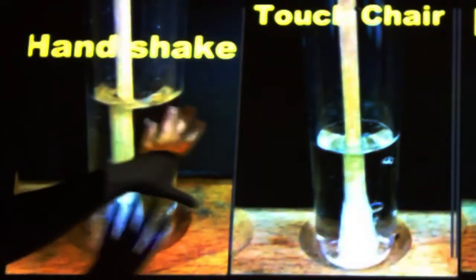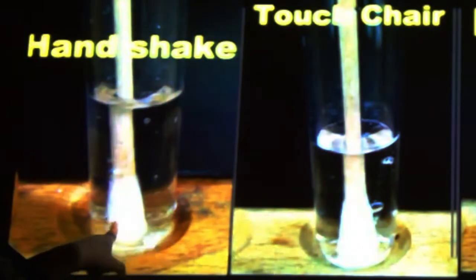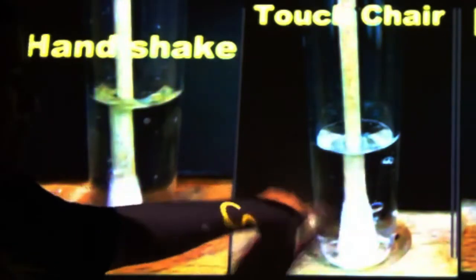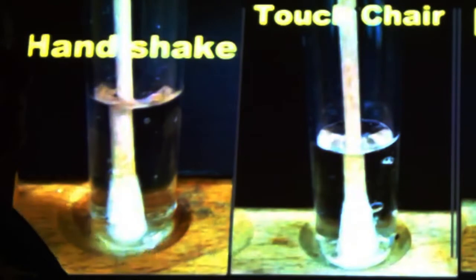From there, we touched a chair. Now, admittedly, there are some big bubbles like you saw in the first, but there are also quite a few little bubbles coming up from the sides as well. Even on the swab, you can see that there are bubbles.